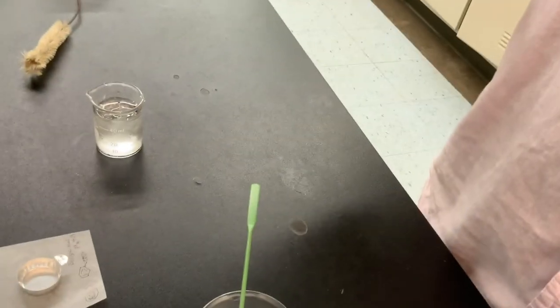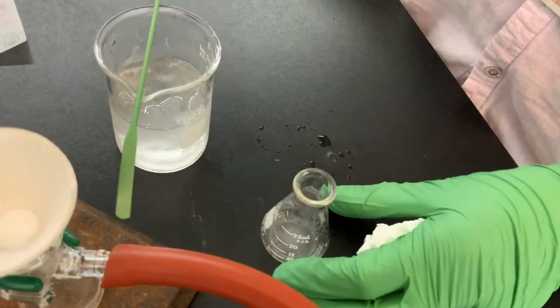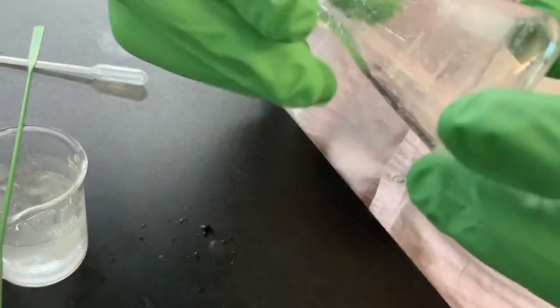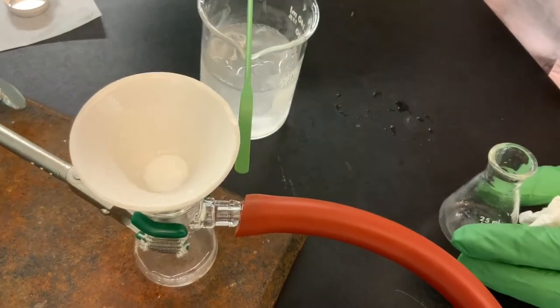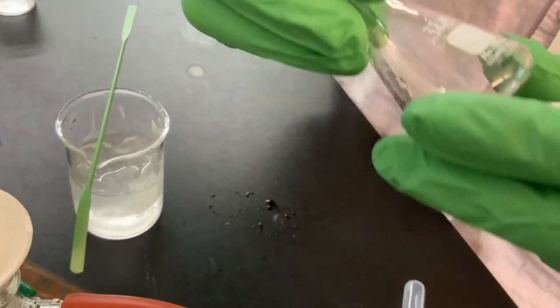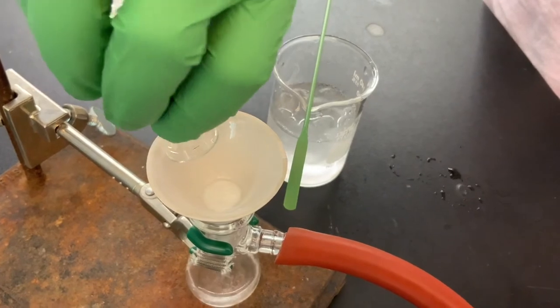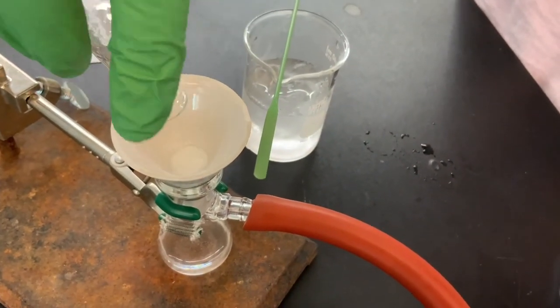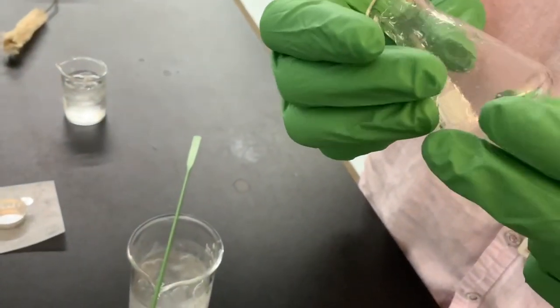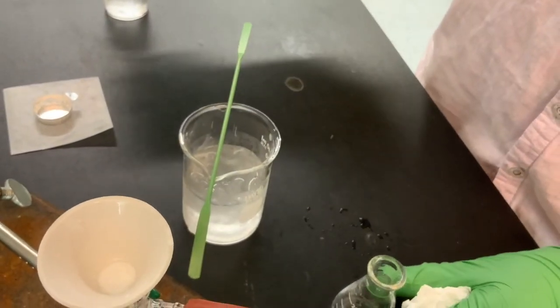I've got a distilled water ice bath. And so I'm not going to use too much. What's this? This is a half ml. Add it to my Erlenmeyer flask here. Swirl it around to try and collect any solid that's stuck to the sides of the glass. And there's number one. Here's another half ml of cold water. Once again, trying to rinse the sides of the flask. Wait for that all to come out. Water really likes glass. And there's just a little bit left, so let's do just one more half ml for good luck.